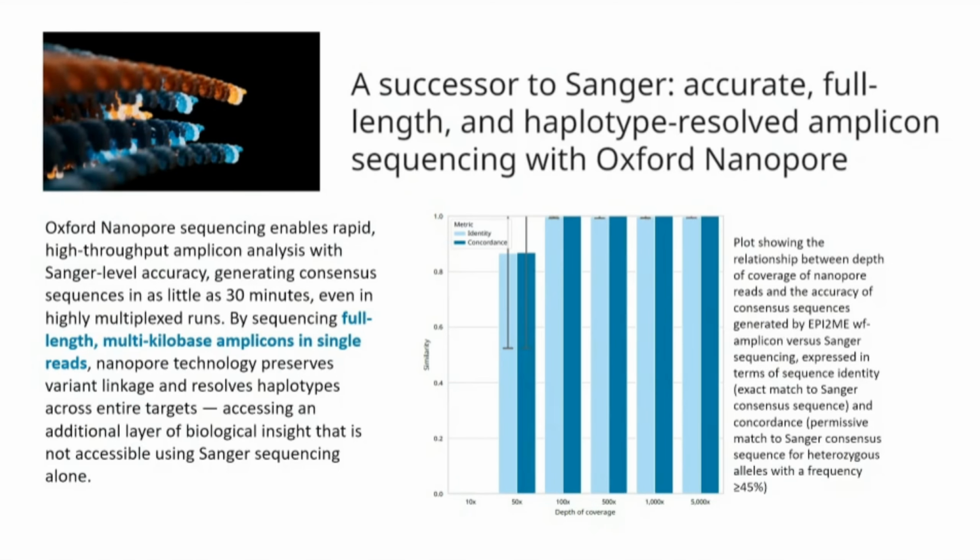So why could Oxford Nanopore amplicon sequencing be a good successor, or even better in many cases? It can be more robust compared to Sanger sequencing because Oxford Nanopore sequencing can sequence much longer DNA molecules. The limitation of Sanger sequencing is that we are normally able to get amplicon sequences of around 1000 bp in size.